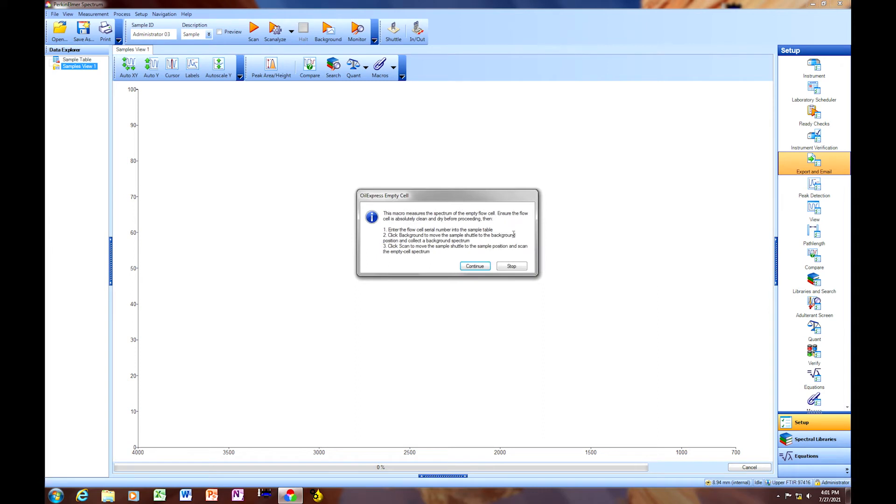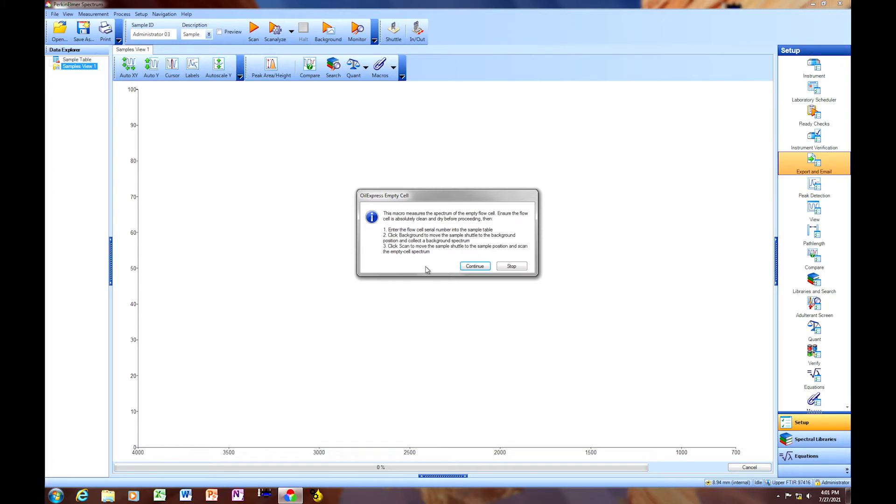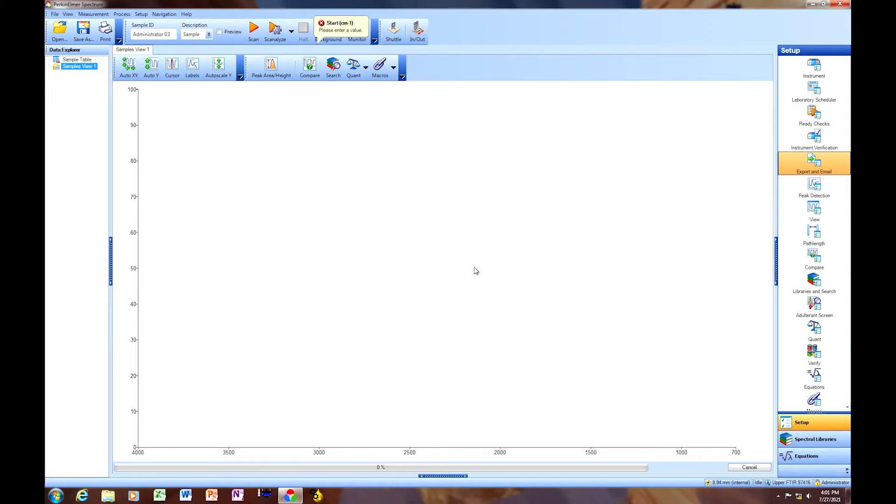In here, there's a brief description or instruction for the flow cell empty cell collection. Enter the flow cell serial number into the sample table, click Background to move the sample shuttle to the background position and collect a background spectrum. Click Scan to move the sample shuttle to the sample position and scan the empty cell spectrum.